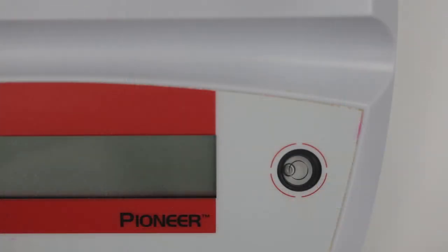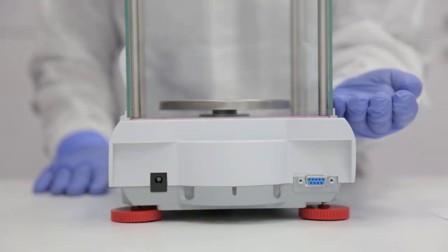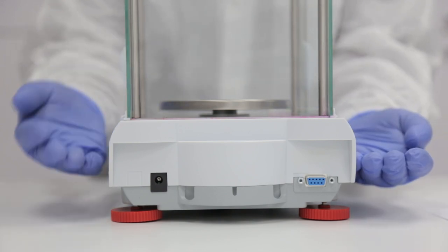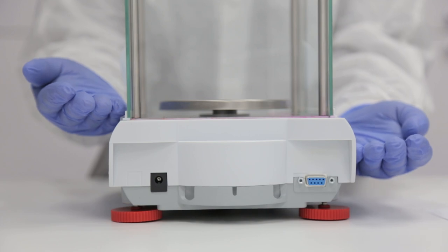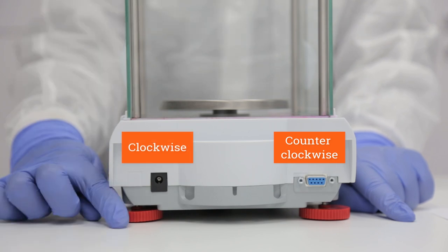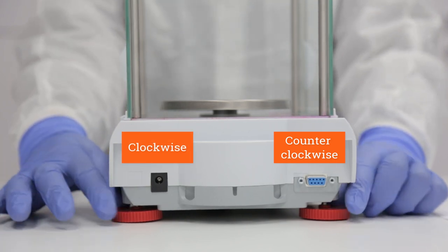Now, if the air bubble is in the nine o'clock position, this means that the left side of the balance is too high. This time, we need to lower the left side of the balance and raise the right side. To achieve this, we will turn the left back foot counterclockwise and the right back foot clockwise simultaneously until the air bubble has been centered in the circle.